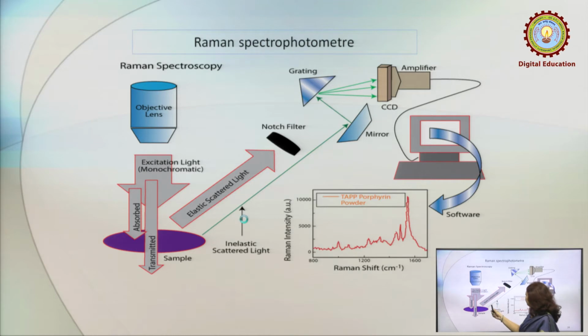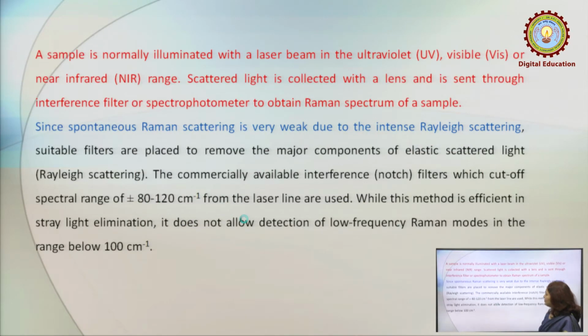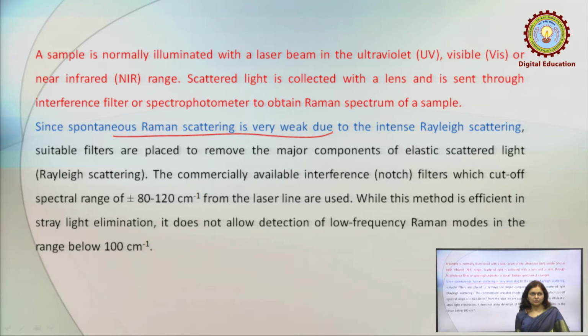The important point here is that spontaneous Raman scattering is very weak due to the presence of intense Rayleigh scattering.